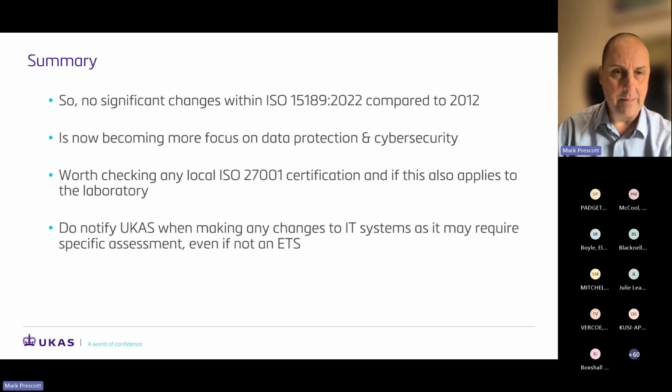But the key thing is really making sure that whenever you've got any changes to your IT system, you fully verify them as needed, making sure that all your end-to-end systems, any external systems, any external parties, all get involved to demonstrate that the system is doing what it needs to. And do let UKAS know if you have any changes to your system, because it may require specific assessment.